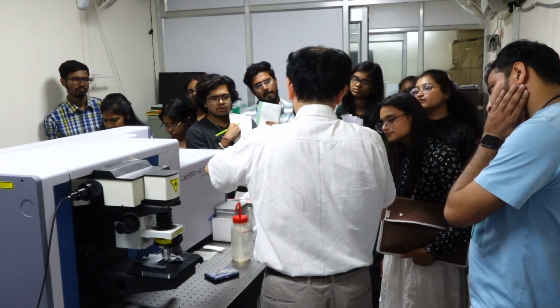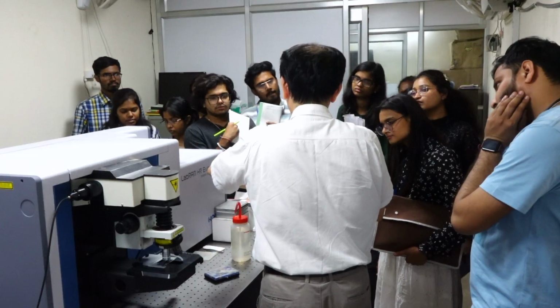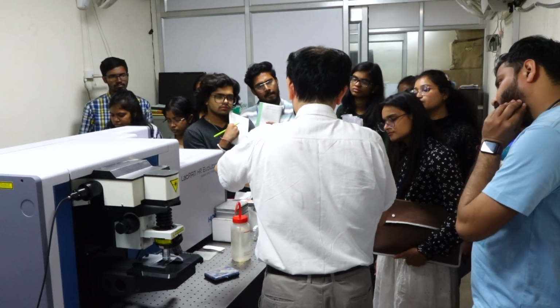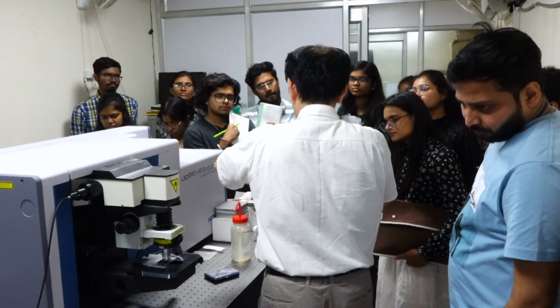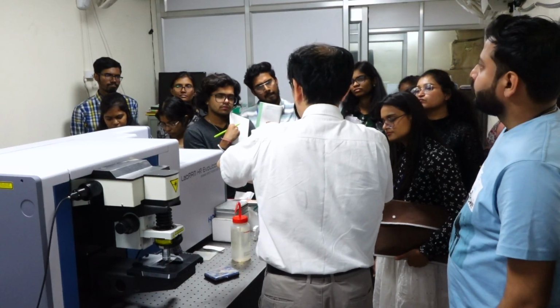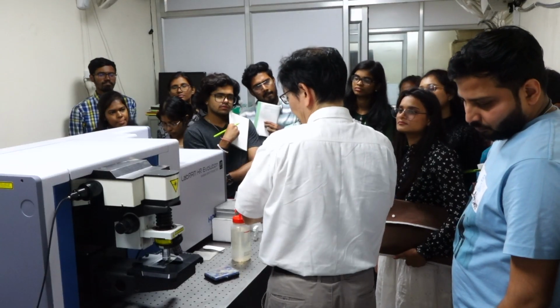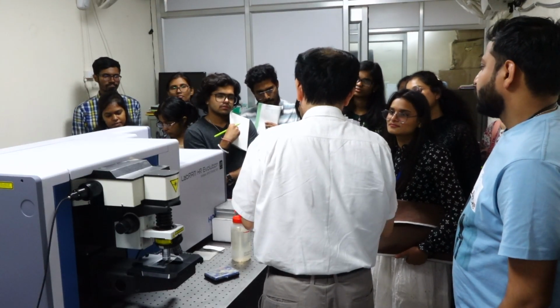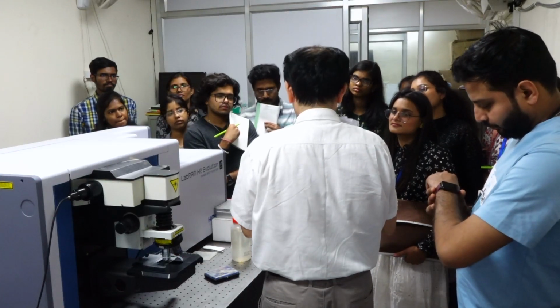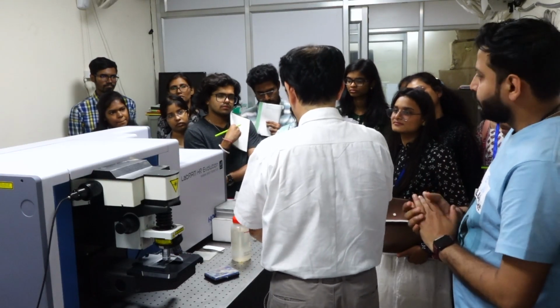If we focus on a smaller area, density becomes larger, and with an even smaller one, density is much larger. Then I0 becomes much larger, and accordingly I Raman gets larger. So if we want to get a strong signal, a smaller focal point is more advantageous. But at the same time, it easily damages the sample.